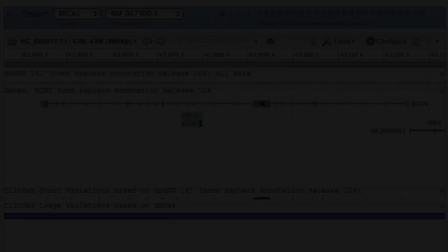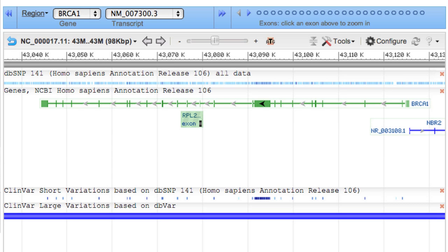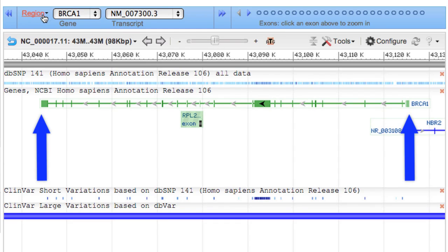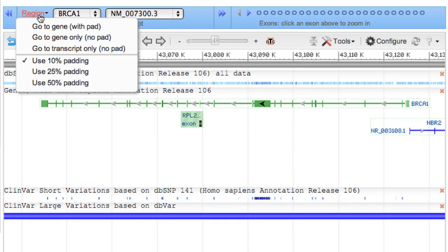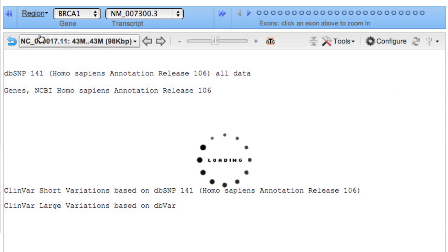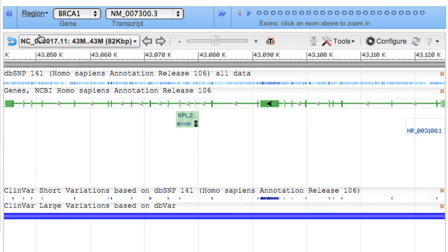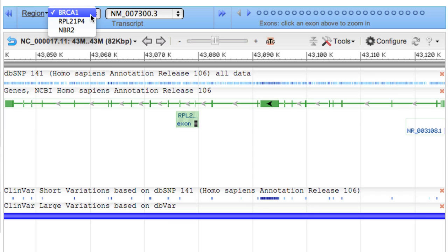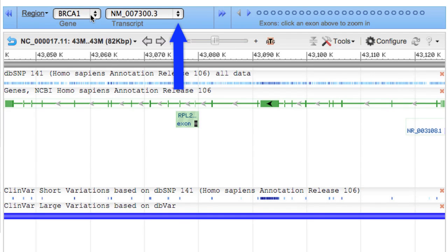I'll spend the next couple minutes demonstrating some of the navigation and view capabilities. Different gene regions can be viewed using options in the Gene Navigator. For example, you can limit the view to the boundaries of the current gene by selecting the Region menu and clicking Go to Gene Only, No Pad. You can switch between genes in the displayed region using the Gene menu, and depending on your zoom level, you can also switch between transcripts.